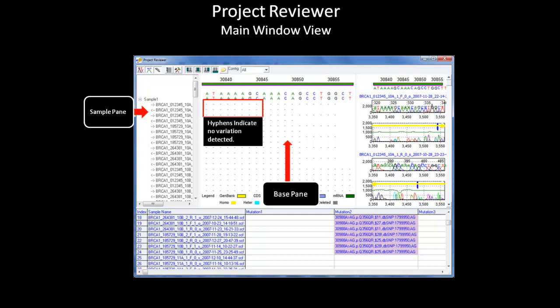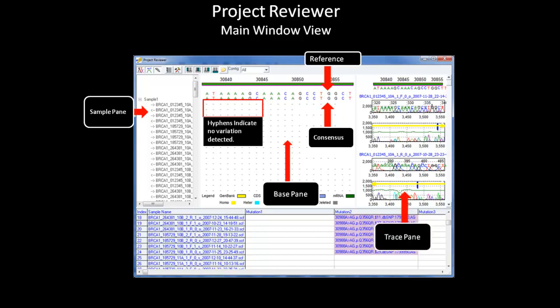The blank hyphen marks indicate that there are no discrepancy for the nucleotide at those positions. In addition, the base pane also displays the reference sequence and consensus sequence constructed from the overlapping amplicons. The trace pane shows the electropherograms of the sample traces.